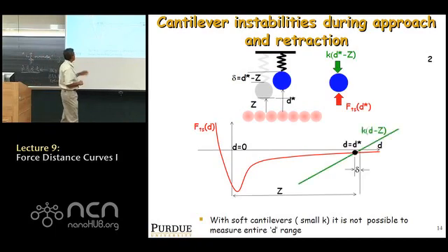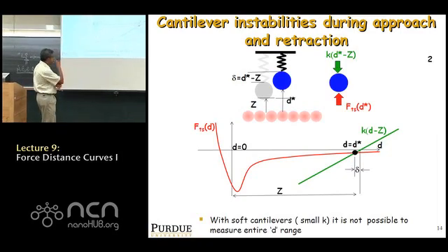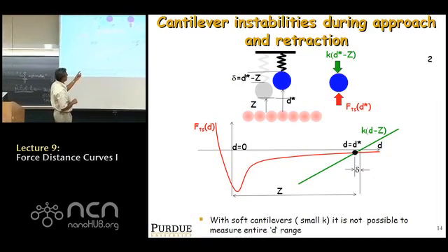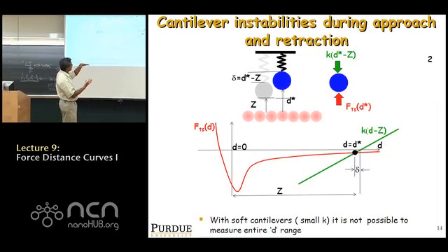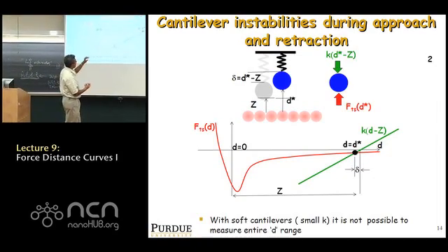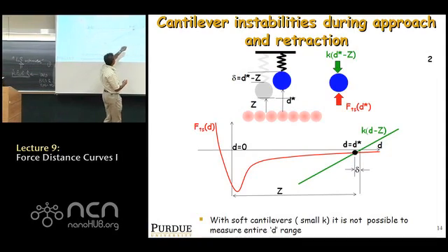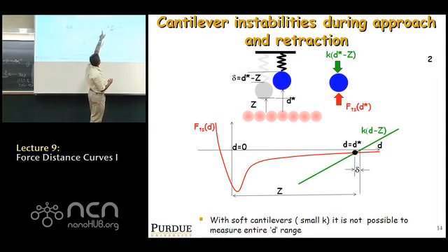You have on this curve F as a function of D, shown in red, and at a certain Z you've got the base of the cantilever located, and graphically you get this equilibrium between these two forces whenever these two curves intersect, okay? So the red curve is F as a function of D, and the green curve is how the restoring force K changes as a function of D, right?